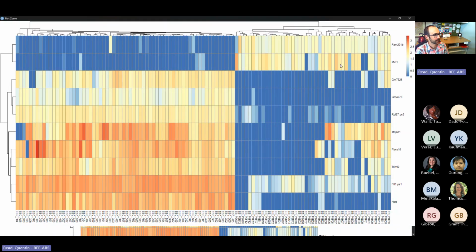If you can see this, these were the genes, the 8 of them that have a lot of red and orange on the left side are the ones that have a high expression in high values of factor 1. There's a couple that have more expression on the right side. Those are the ones that had high expression with low values of factor 1. And now if you look at the names of the samples, you can see that these ones are all ESC and these ones are all EB.